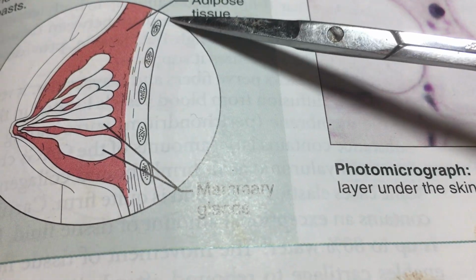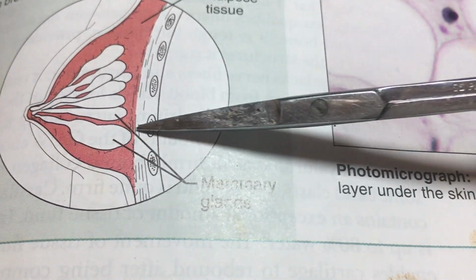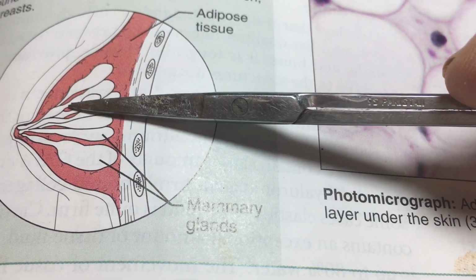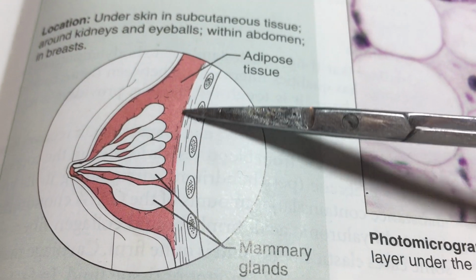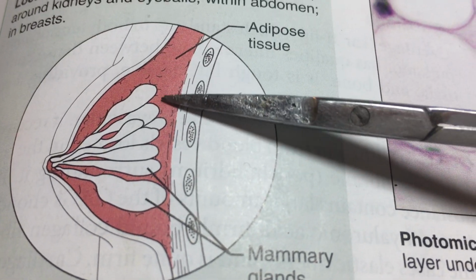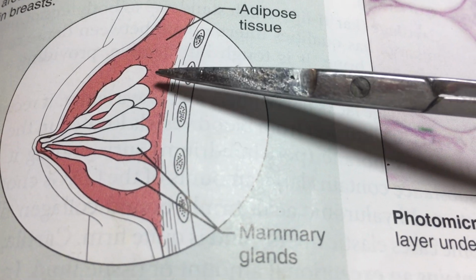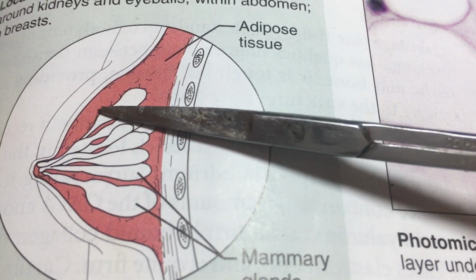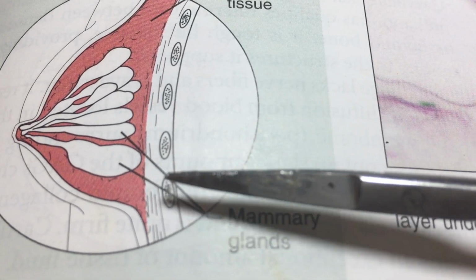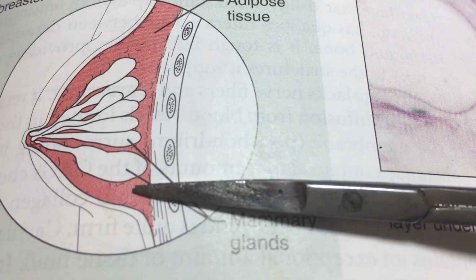There's going to be individual glands that are separated by a little trabecula of connective tissue. But then in support of all this energetic activity is going to be fat. So that's going to be a common addition to wherever we would be finding this particular thing.